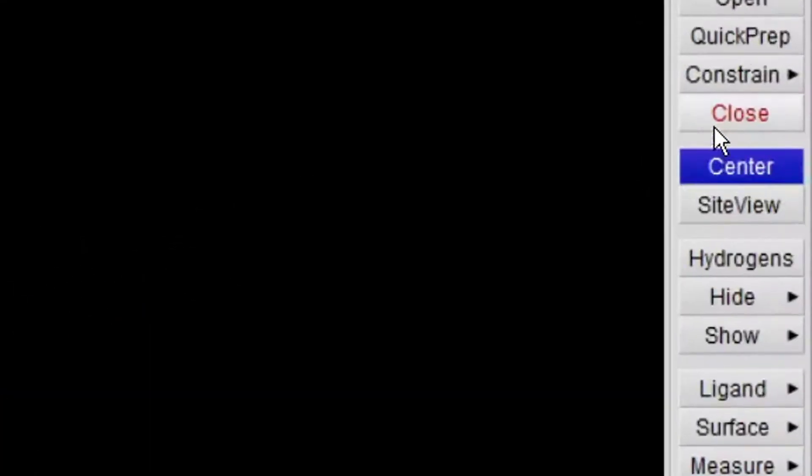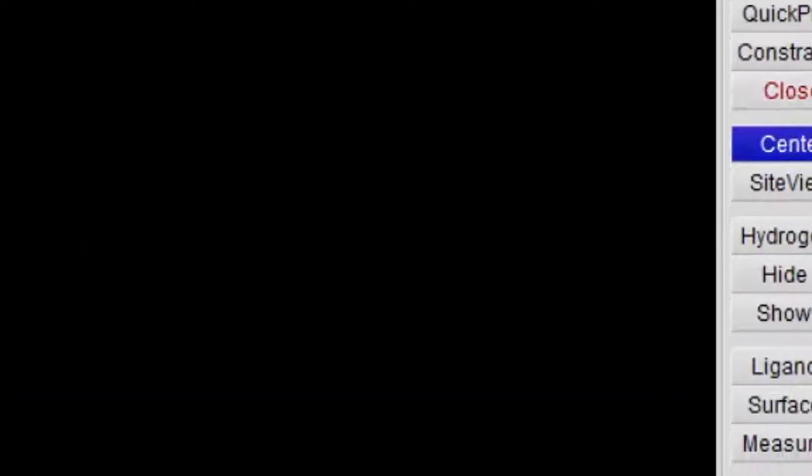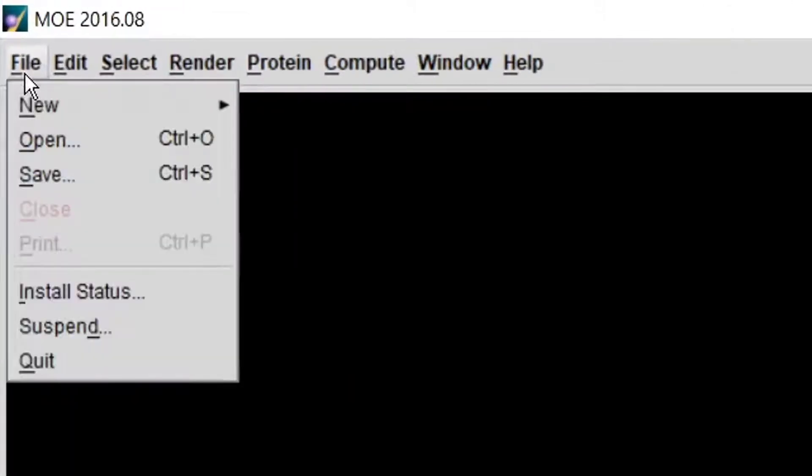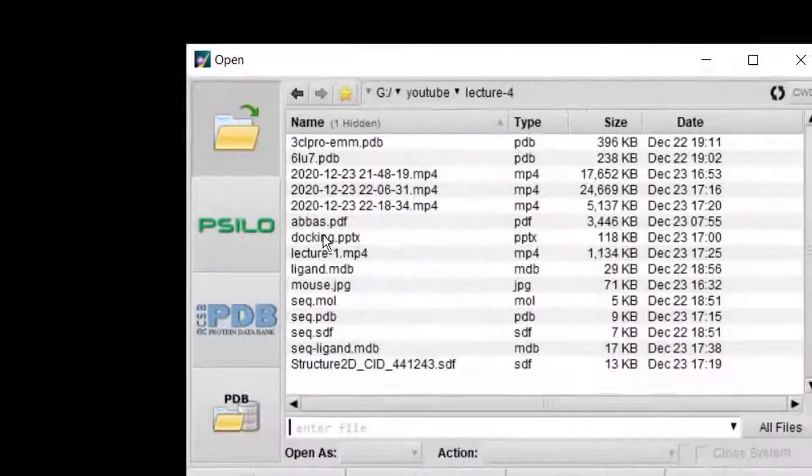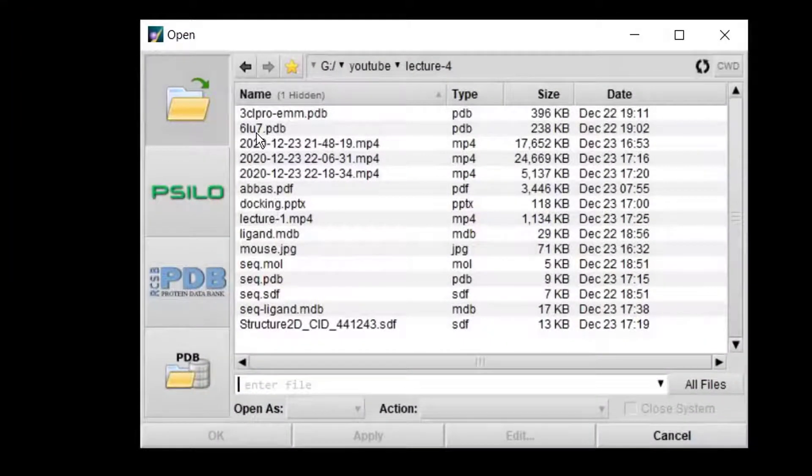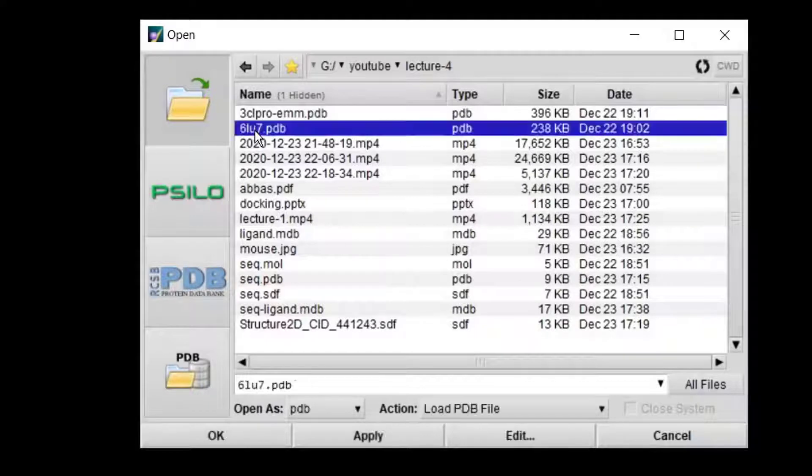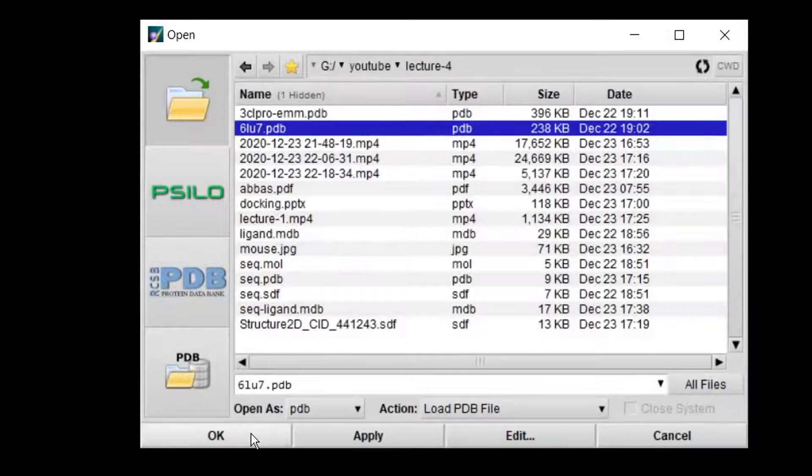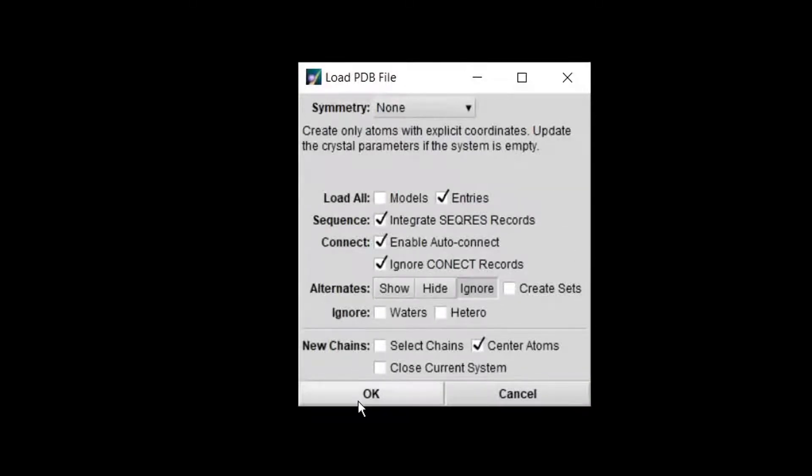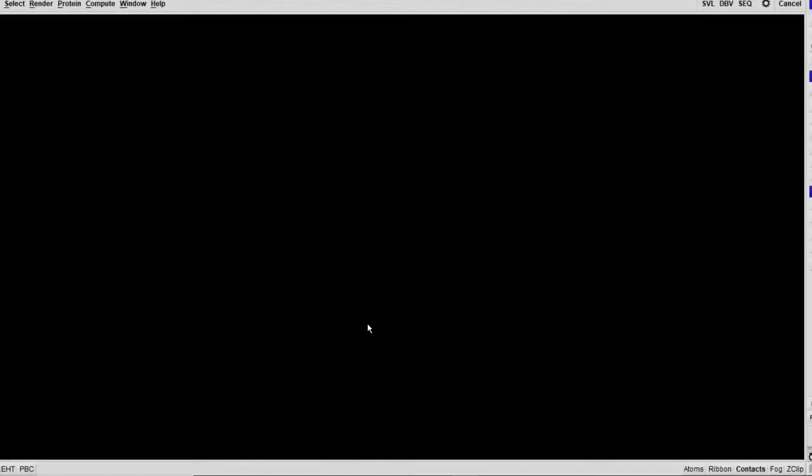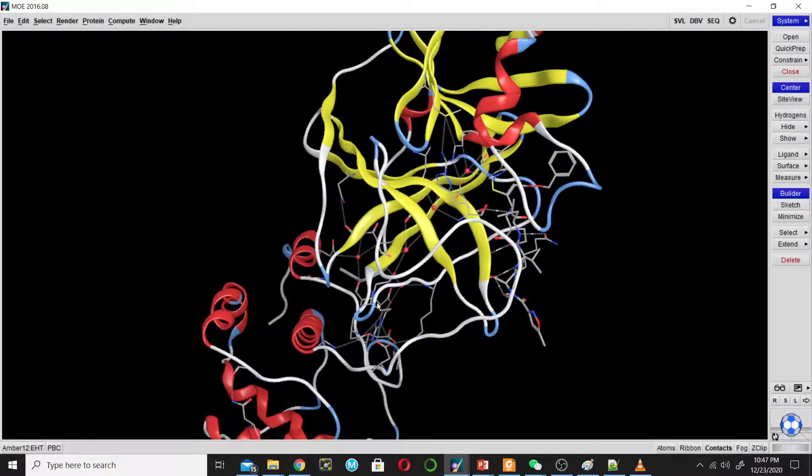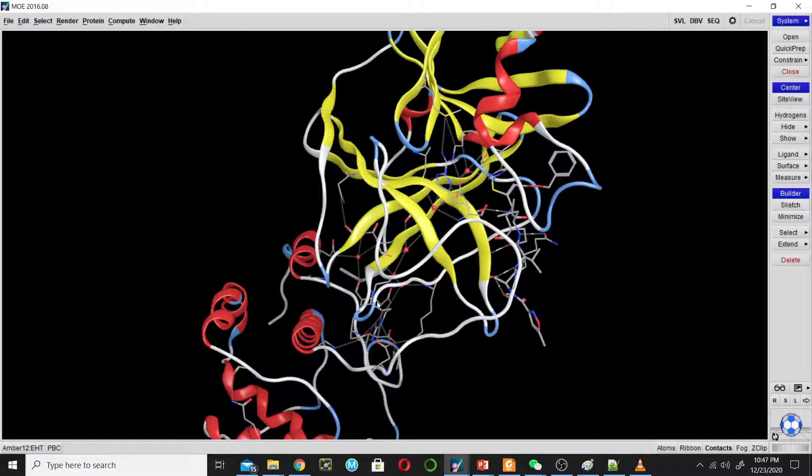Close it from here. Now open the PDB structure. Go to file menu, click on open, and this is the PDB structure. Click OK, leave this as default, and click OK. This is the structure of 3CL Pro.